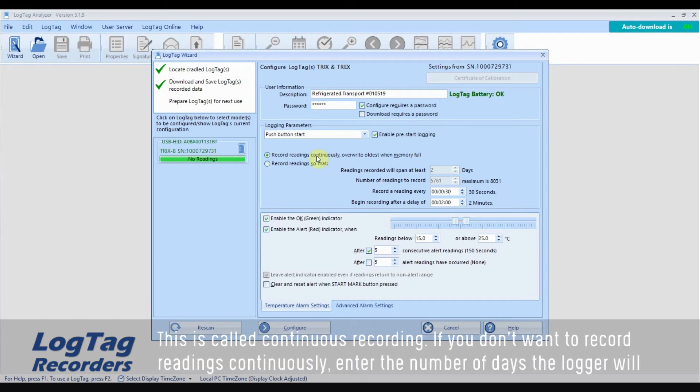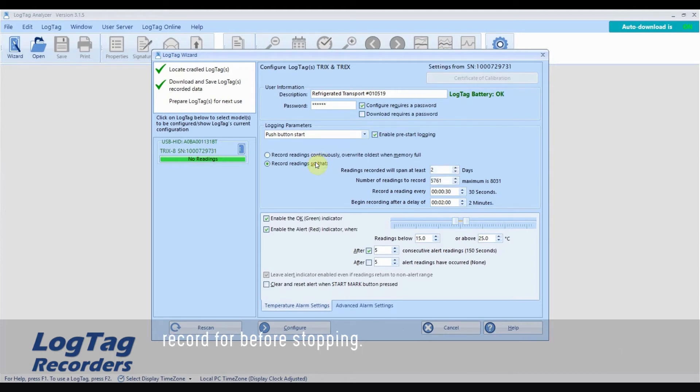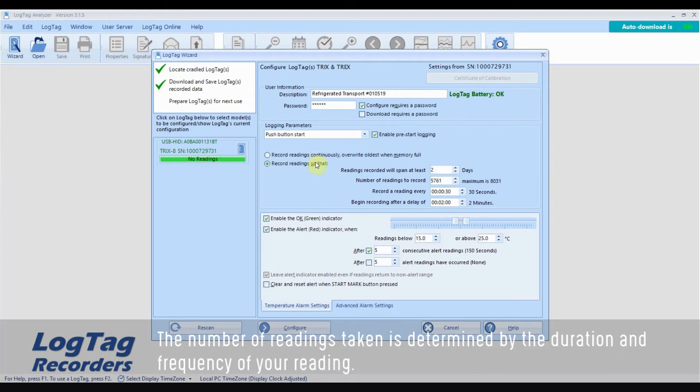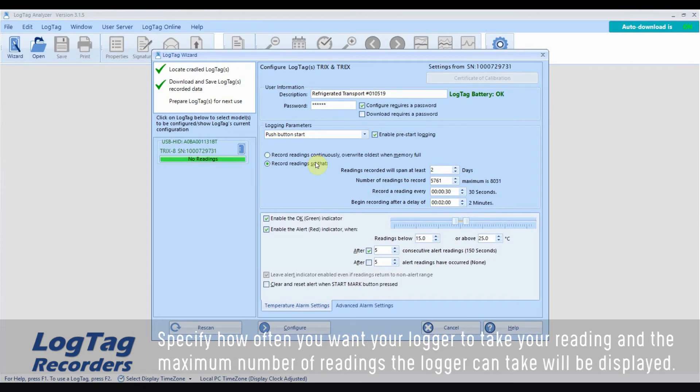If you don't want to record readings continuously, enter the number of days the logger will record for before stopping. The number of readings taken is determined by the duration and frequency of your reading. Specify how often you want your logger to take readings and the maximum number of readings the logger can take will be displayed.